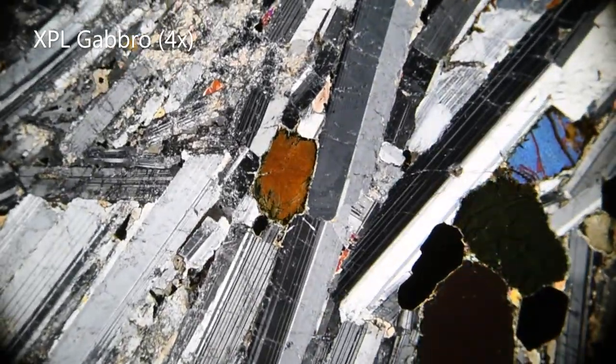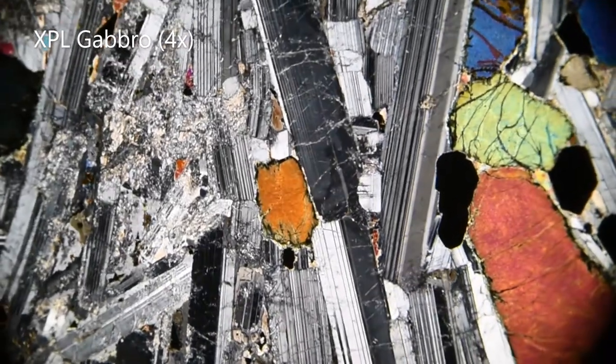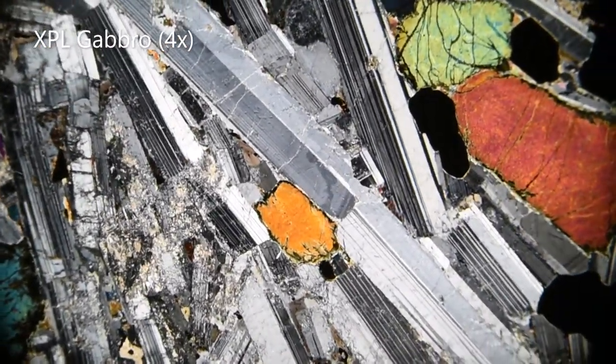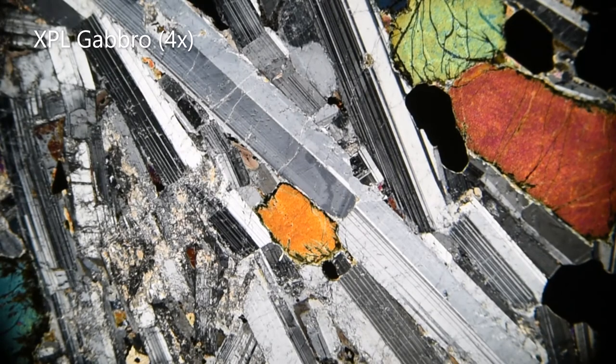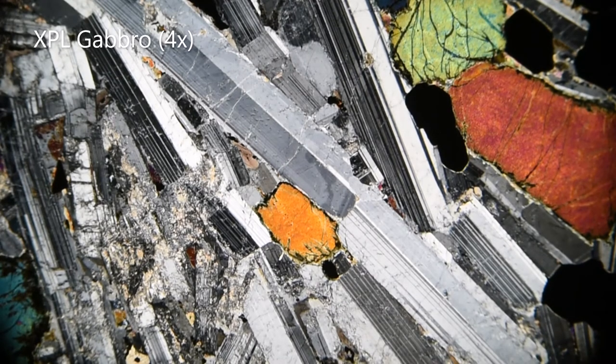In cross-polar view, the feldspar has stripes, which we call twinning. This, along with the low-interference colors, are primary identifying features of feldspar.